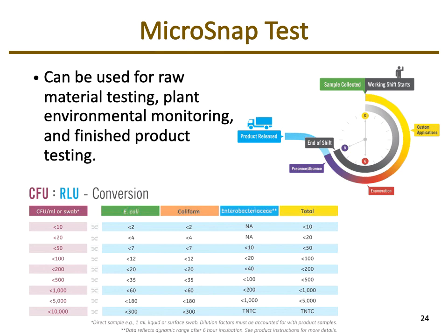The thing I forgot to mention in that previous slide, if you view it on PowerPoint, there is a video that talks about the procedure to do it. You'll notice the procedure, compare that to your standard plate count where you're doing a serial dilution and then plating. Think about, from a training personnel standpoint at a company, which technique would be easier to train someone to do, and definitely the MicroSnap test would be easier to do. So there might be a little bit more of a cost to it, but you would be able to run more tests in a short time.